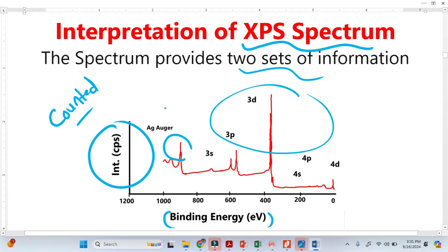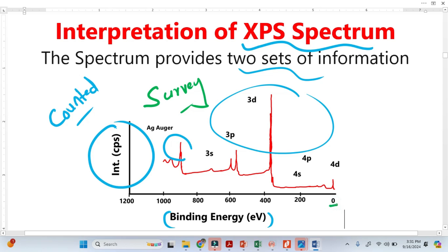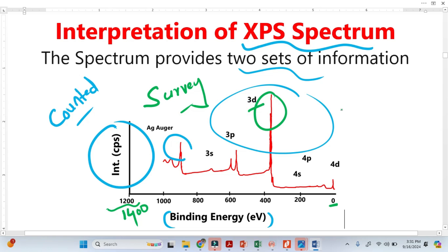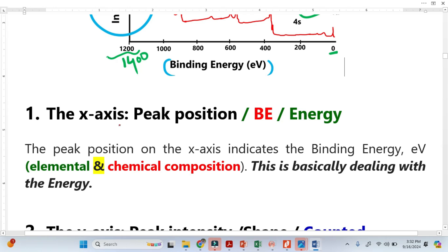This is basically the survey spectrum. We know the energy range is from 0 to 1200 electron volts, or up to 1400 electron volts — this indicates it is a survey spectrum. The second important identification is that the peaks are convoluted here. We know 3d makes a doublet, 3p also makes a doublet, 4p also makes a doublet, but we do not see those doublets here — this confirms the spectrum is a survey spectrum.